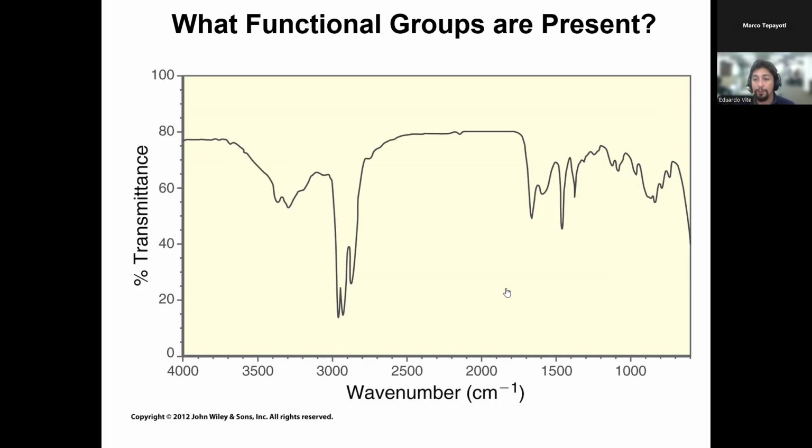In terms of the CH stretches of the aromatics, again, unless you already know your molecule has a ring, there's no real way to tell if it's a CH stretch of an sp2 or an sp3. We kind of just know and justify it based on what we suspect it already is. Remember, you can't look at a single spectra and tell me the entire identity of the whole molecule. It's just part of the whole information that you need.